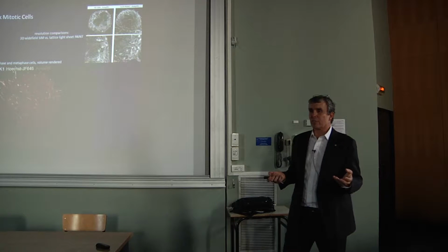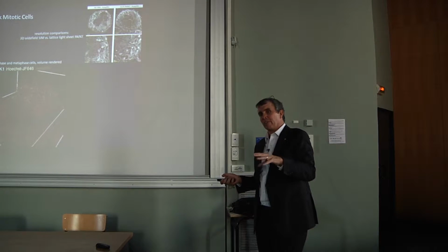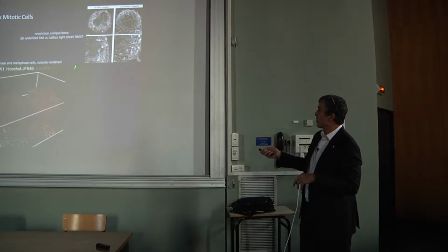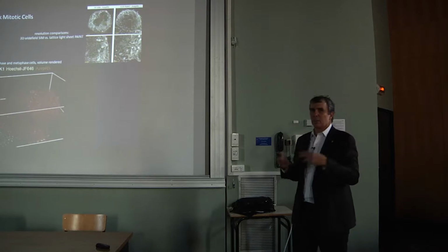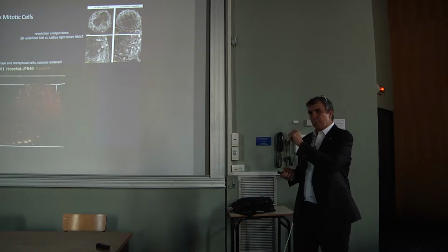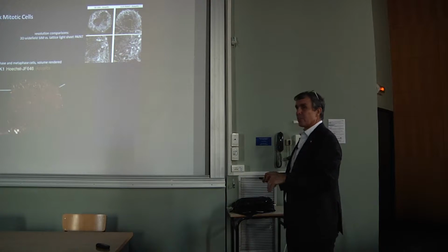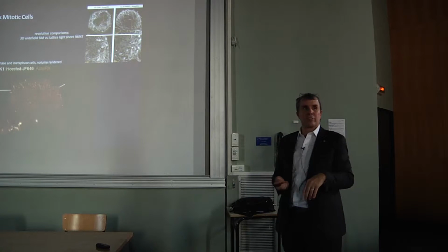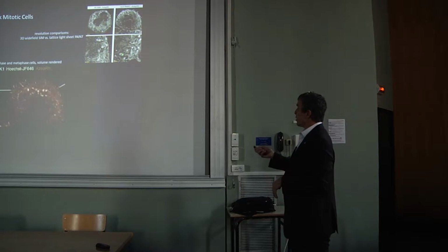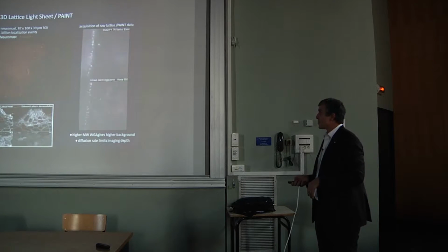It's often used in 3 dimensions, but it's really limited because it's a wide field technique and there's always a lot of background. And so if you go into something this thick, you get nothing but artifacts when you try to look at the sample. But again, because of that property of the lattice light sheet, that we restrict the excitation and have almost zero background from the out of focus, the PAINT is able to maintain its resolution even in these thick specimens.